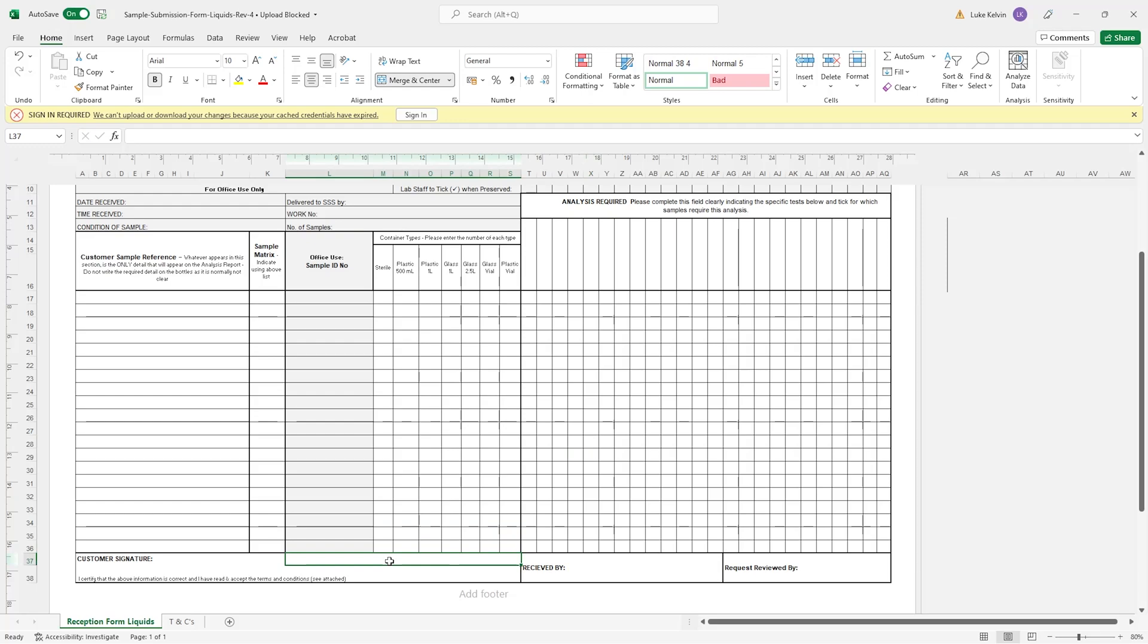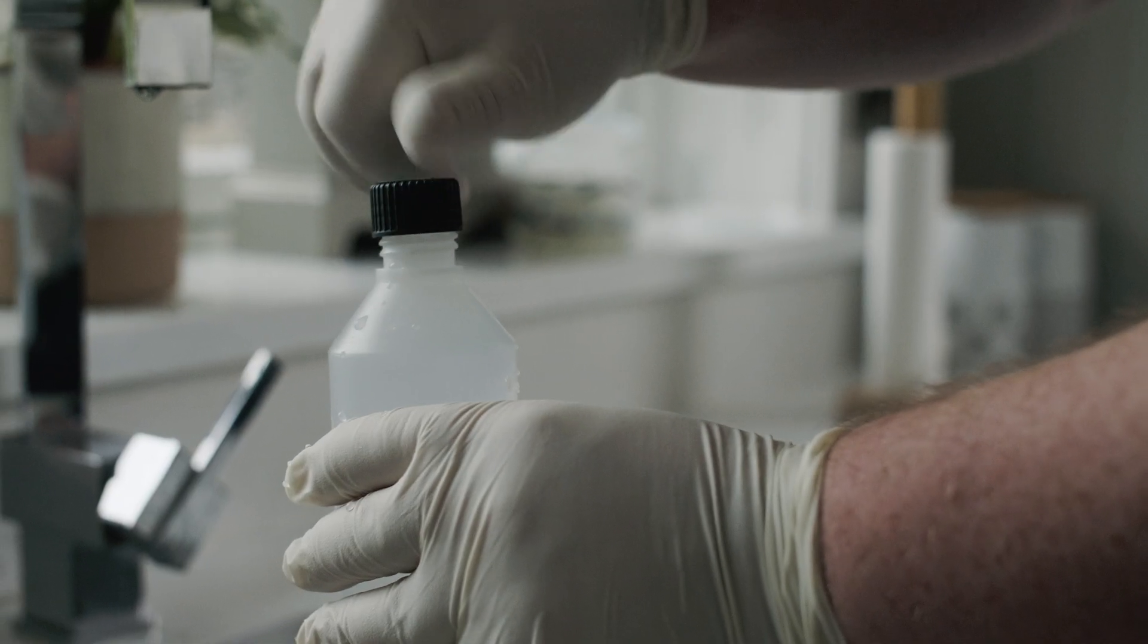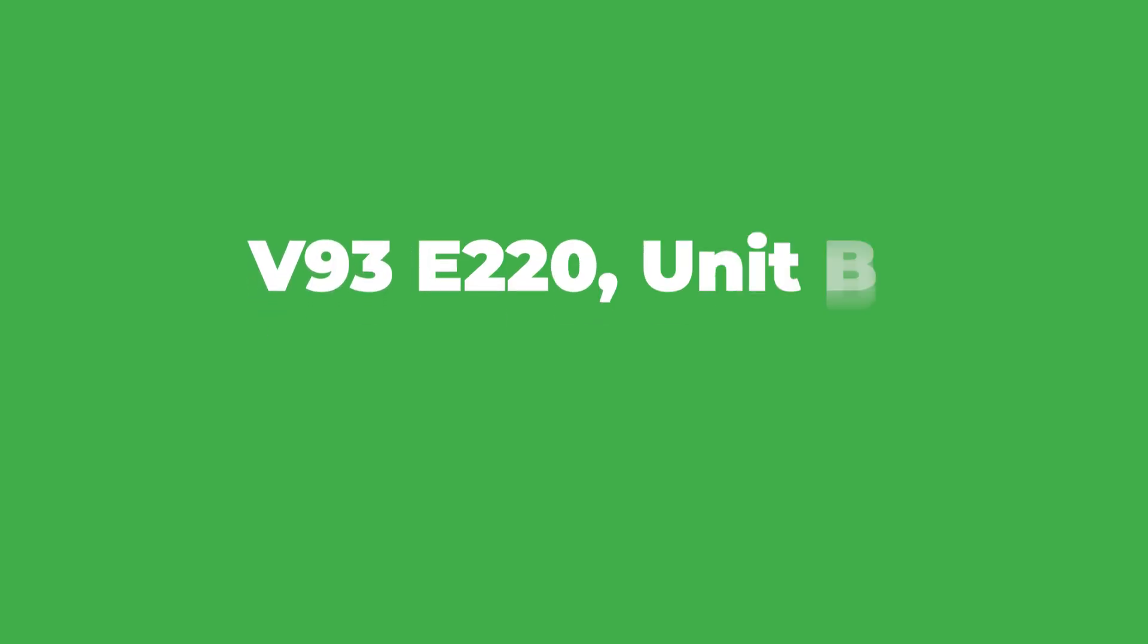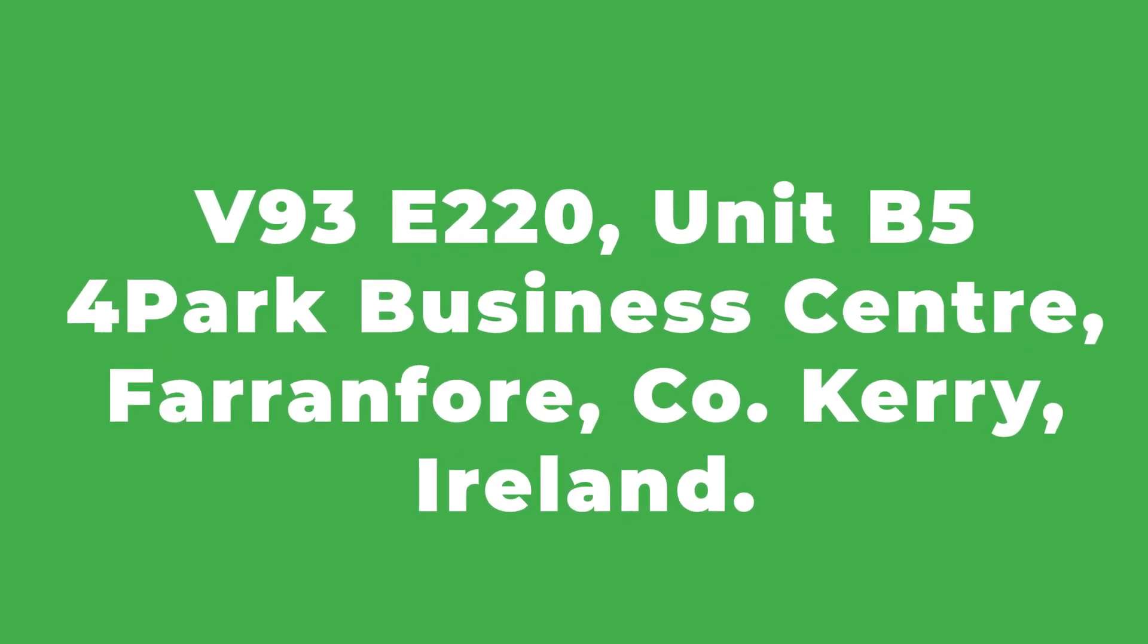Finally, add your signature to the bottom of the form. And you're done. Once your sample is filled and your reception form is complete, you can reseal the envelope and post it or drop it into this address.